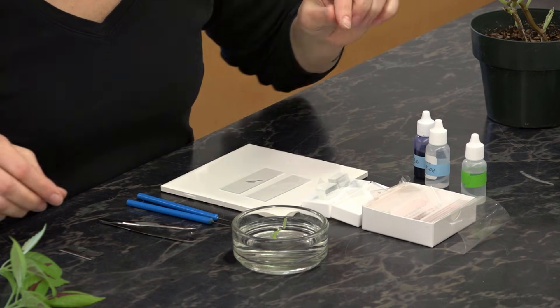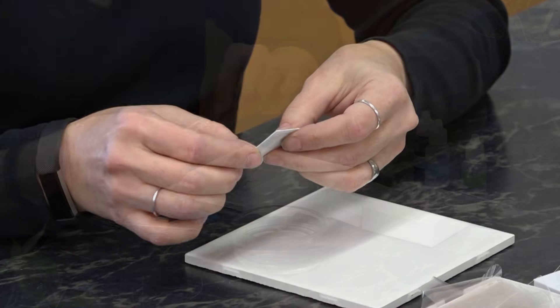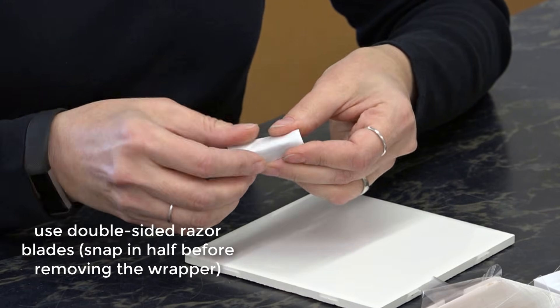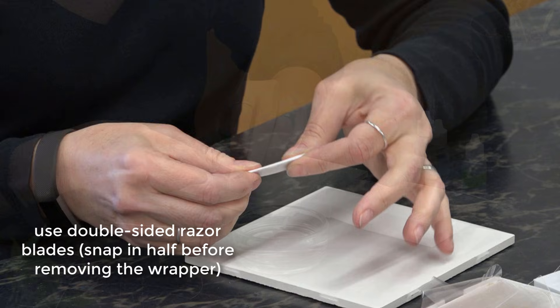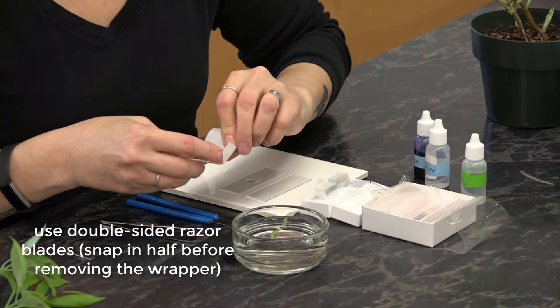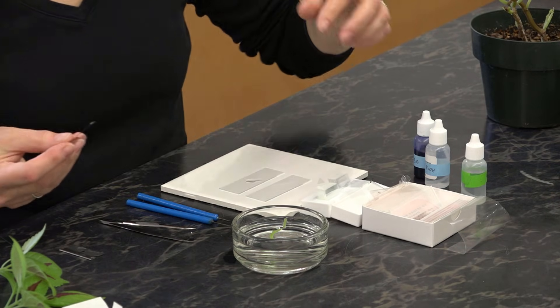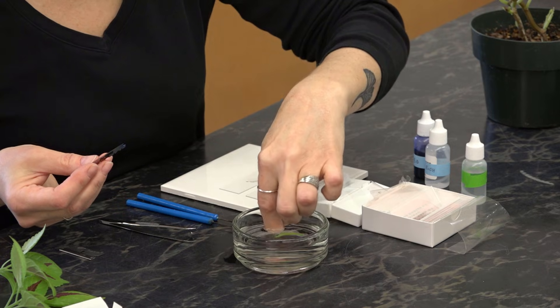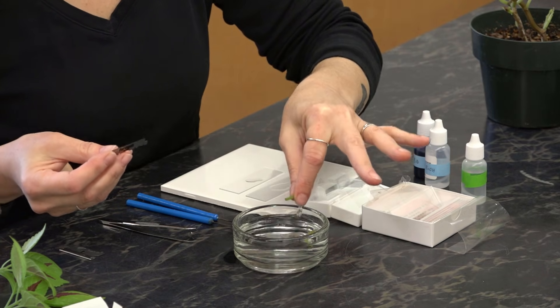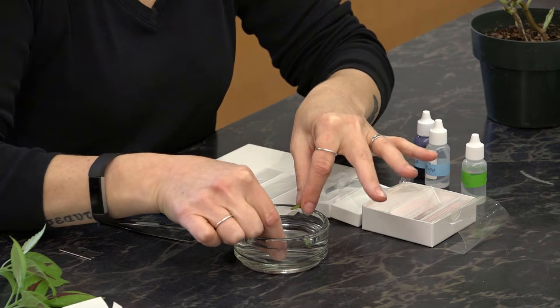To make the hand sections, we want to use a fresh blade. You're going to want your plant material moistened and you're going to want your blade moistened.